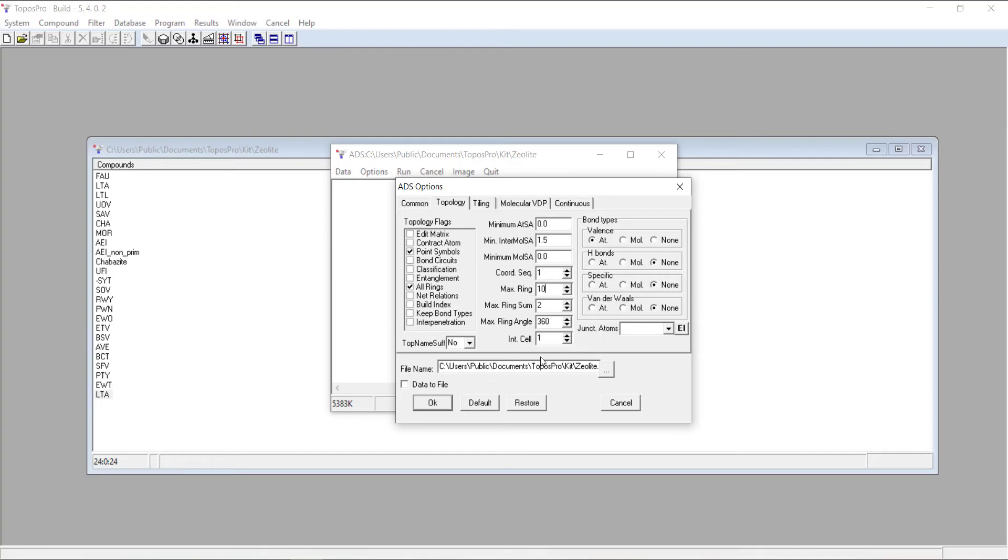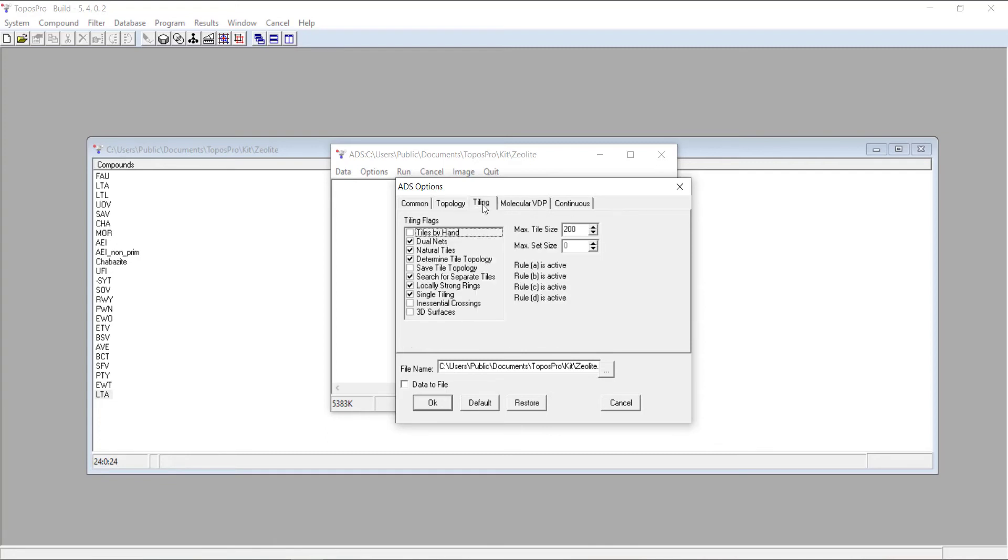All the other options are just set as default. It doesn't actually use these bond types here. Then we'll navigate to tiling and you can see again, you need a few extra options selected. You want these dual nets, natural tiles.